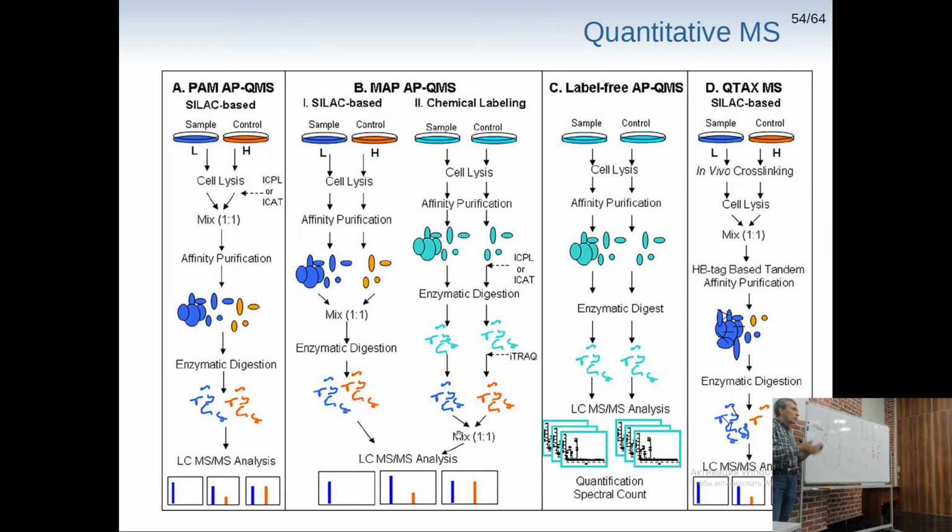We can put a fluorescent label, as we did with our 2D gels, right? We wouldn't be able to see it here. But we can label our proteins of interest with some stable isotope, so the mass would be different. Or label with some post-translational modification which will be cleaved from it, right? We can add some chemical, artificial modification to our peptides or proteins, which allows us to discern between them, right?